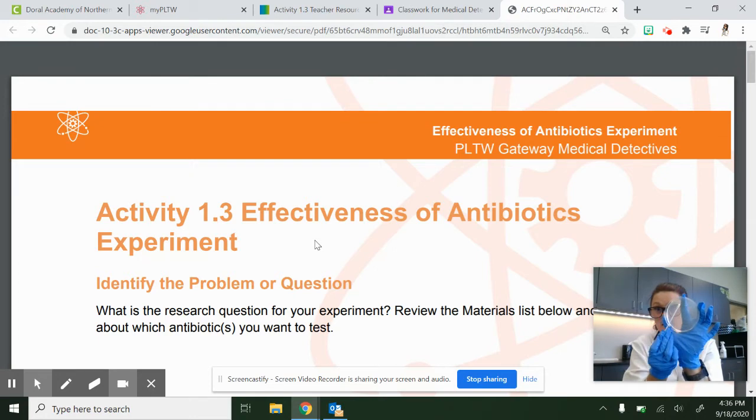So I'm going to run it this way like we did in class. And then I'm going to flip it, and I'm going to do it again. And I'm going to flip it to a 45-degree angle, and I'm going to do it again. So I've never taken my Q-tip and put it back into my bacteria. I just did it one time. Then I wiped, rotate, wipe over right, rotate again, wipe over right.